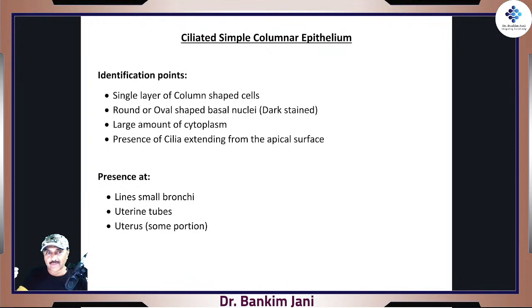So in some cases I might say, Chirag, just take the slide out and watch it straight away, not under the microscope, just with your normal eyes, and you'll be able to appreciate that this is a structure in which there is a big lumen.